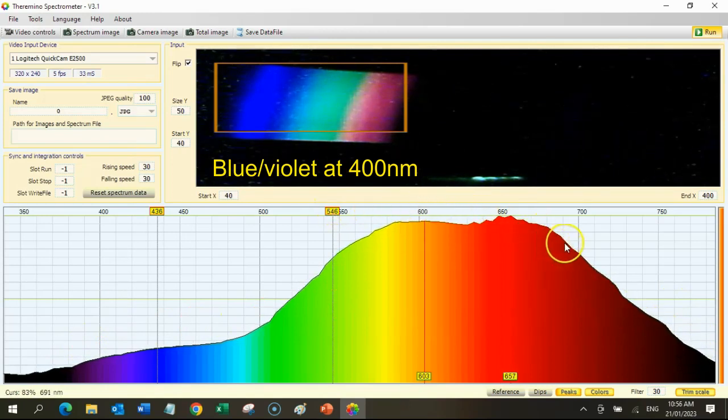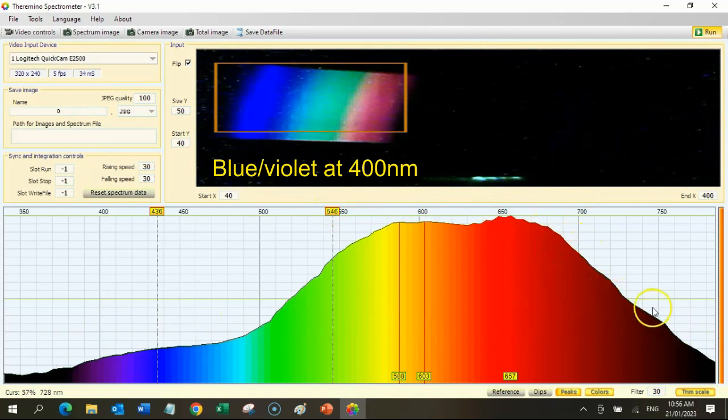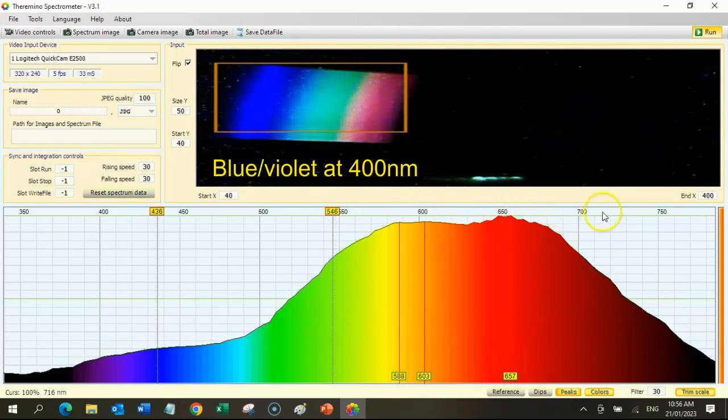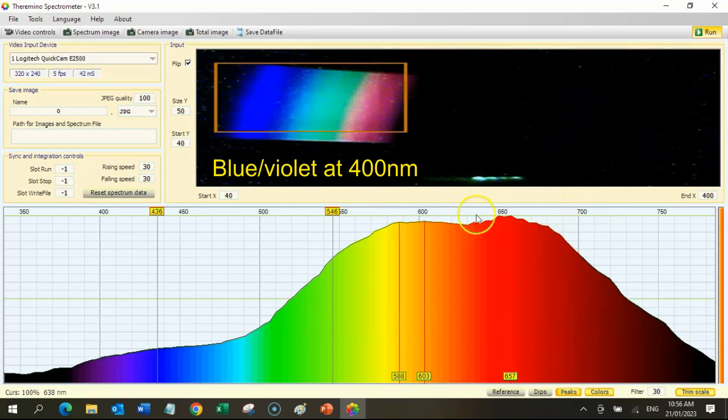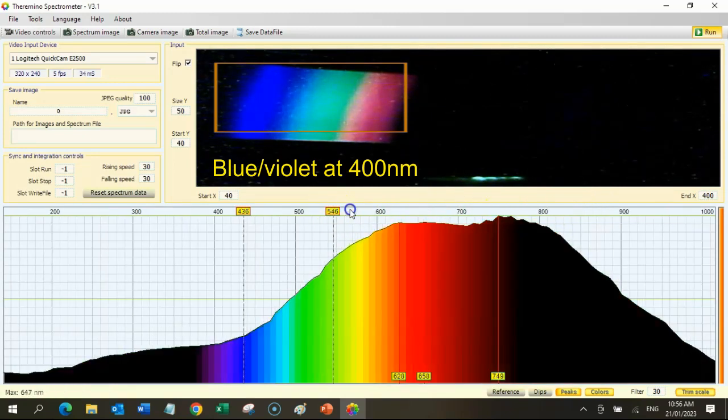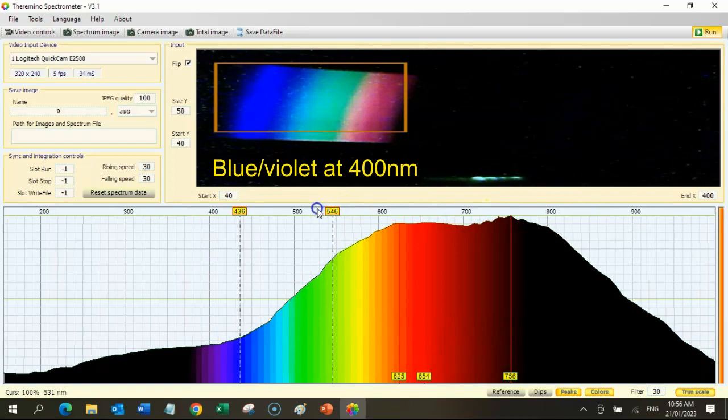You might have to play with this a bit. You may need to use the scroll button on the mouse to ensure that the spectrum you want fits on the screen.